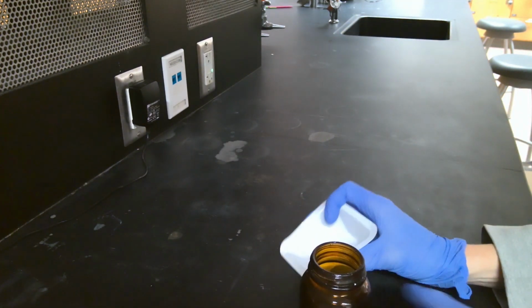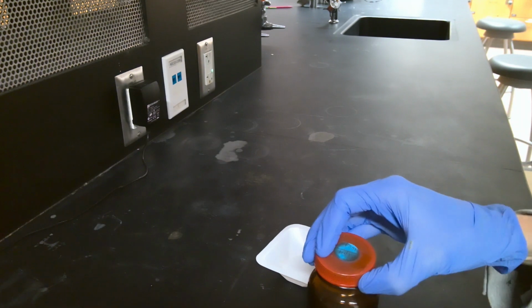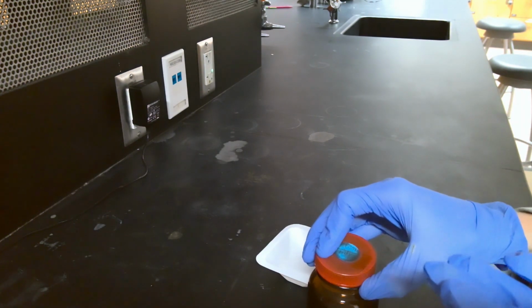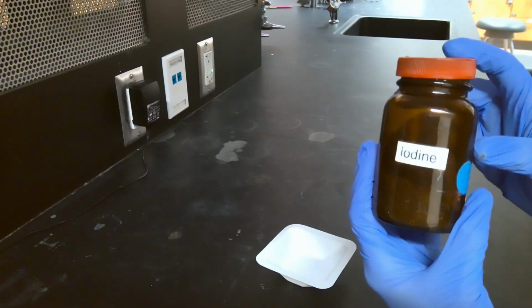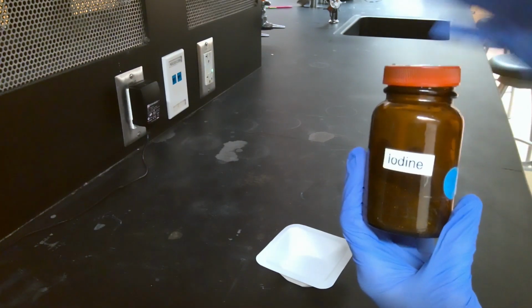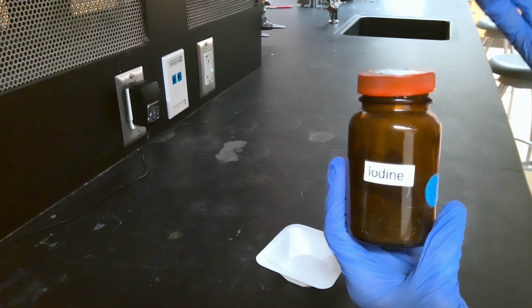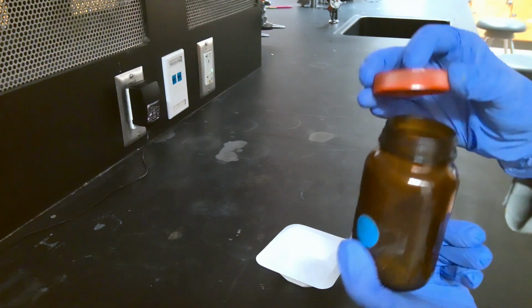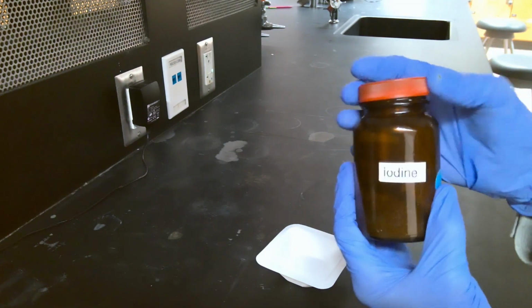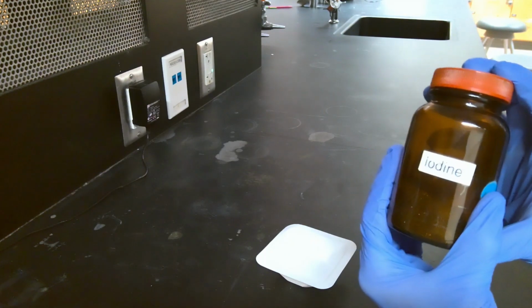When you breathe in this gas, your lungs start to burn immediately, and very quickly you'll develop pulmonary edema and die. So it's definitely something you want to be careful with. Even small doses of exposure to iodine over the long term can cause other issues, such as thyroid disease. So again, be really careful when working with iodine in the lab.